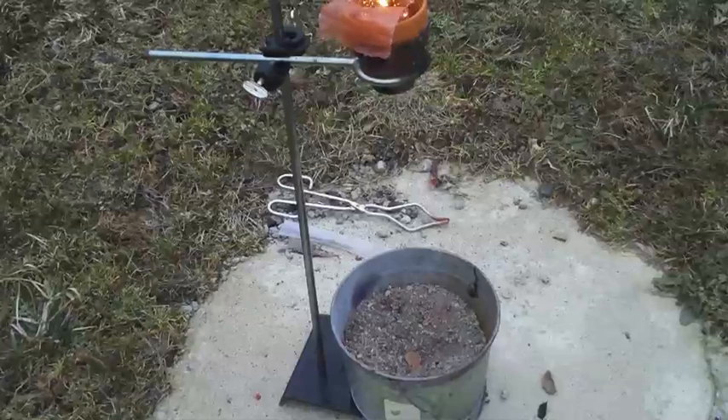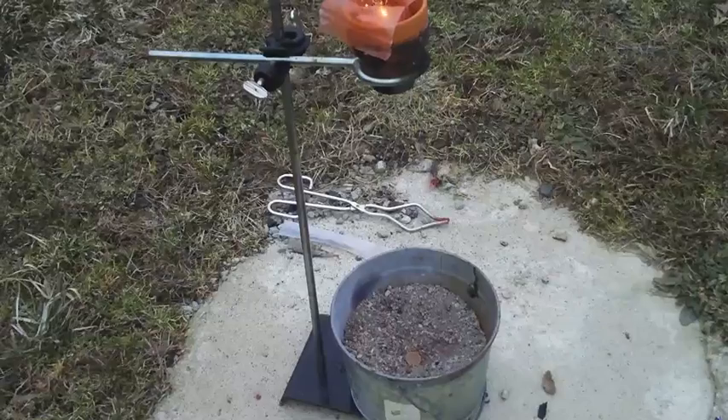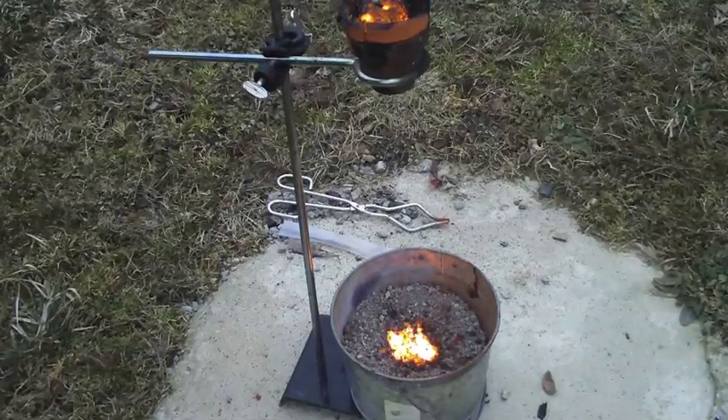Got to burn down to the thermite. What you want to look at — come on up forward now. Just don't get — let me turn the camera off.